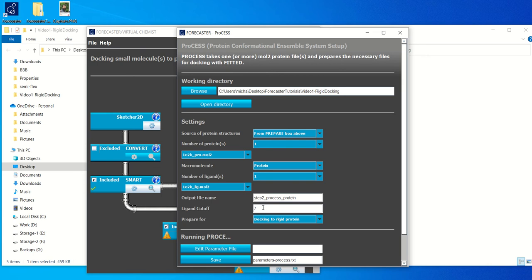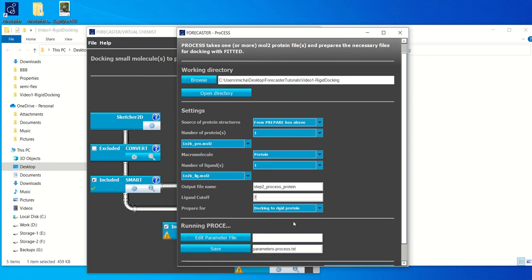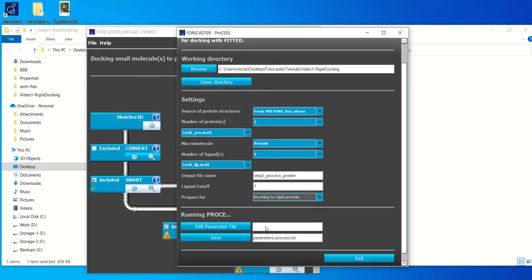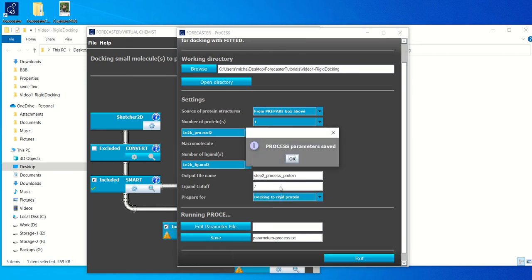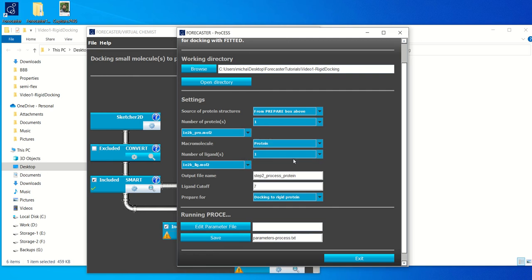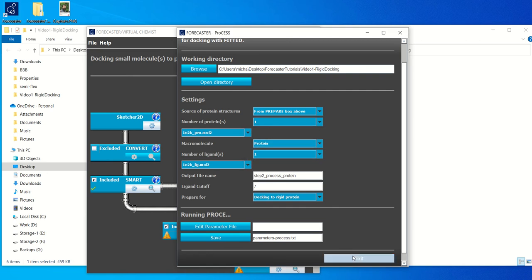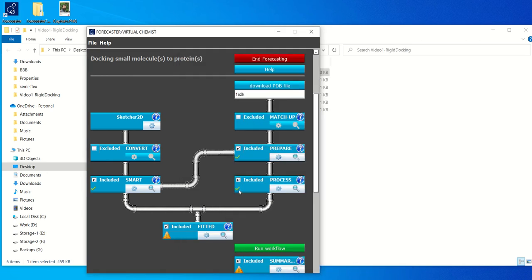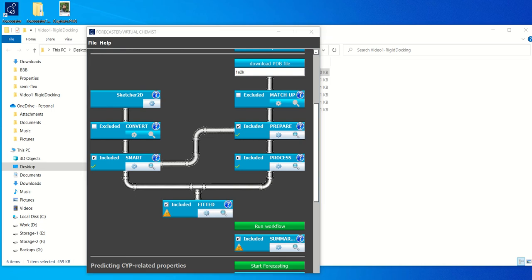Again, you can choose smaller. I wouldn't go smaller than 5. You can choose 10. Then you include more amino acids and then your docking might be slightly slower. And then we want to prepare it for docking to rigid protein. Once this is done, you click save. You have the little check mark. And now we are ready to set up the final step within our docking, which is fitted.